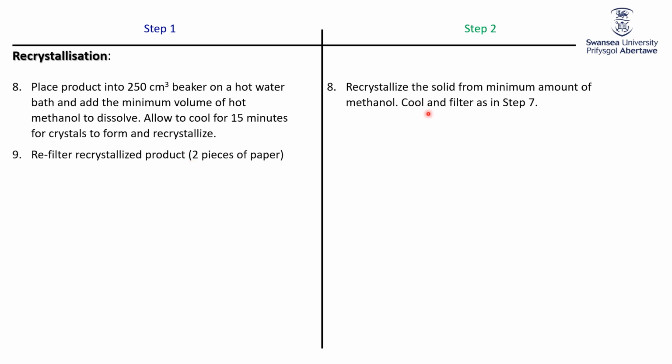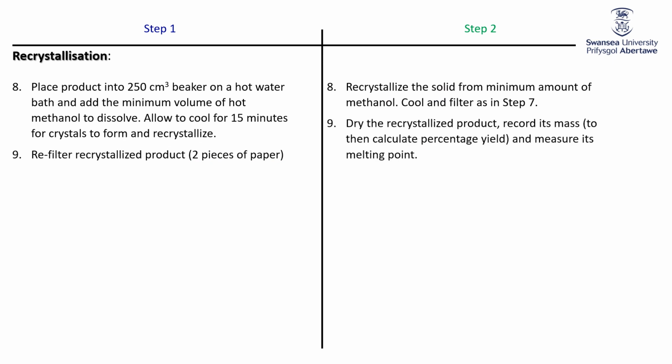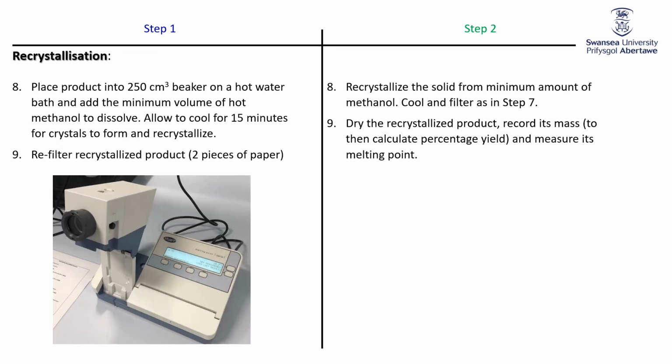In both cases you need to filter, so you're actually going to do 4 vacuum filtrations, and then if it dries well enough, and remember you've got to be out of here before 12 o'clock, then you can measure its melting point. You will have some of our demonstrators, I'm hoping actually quite a few of our demonstrators from the chemistry department who are familiar with the lab, who will help you out with all this. And of course I will be around, and I suspect Enrico will be around to help you out.